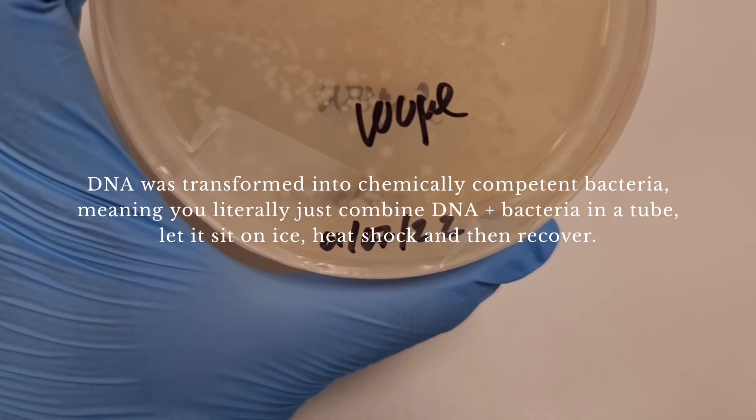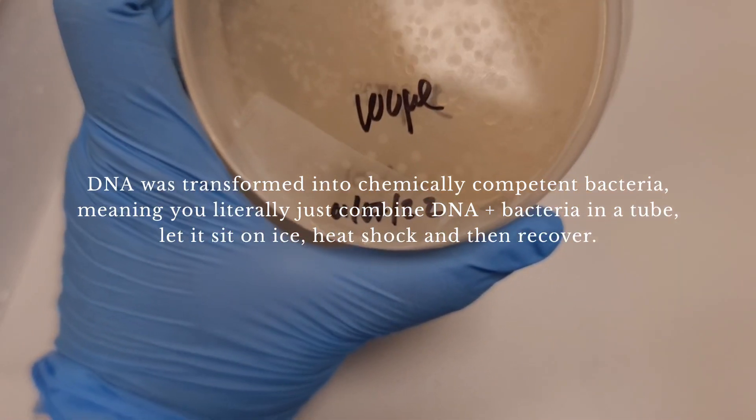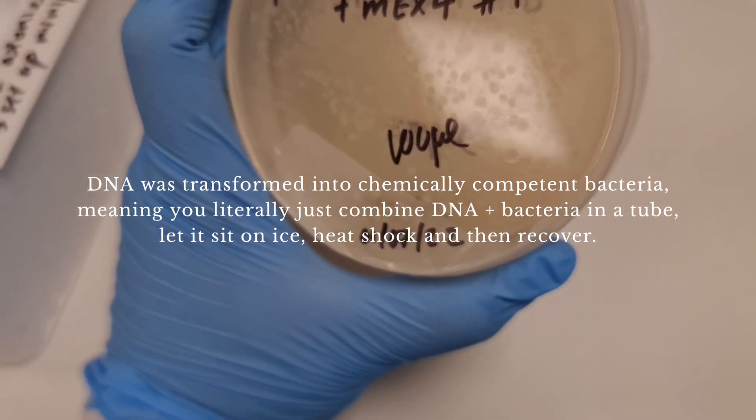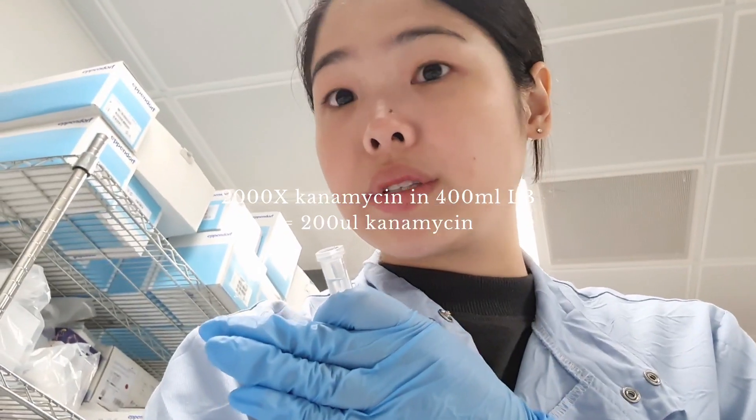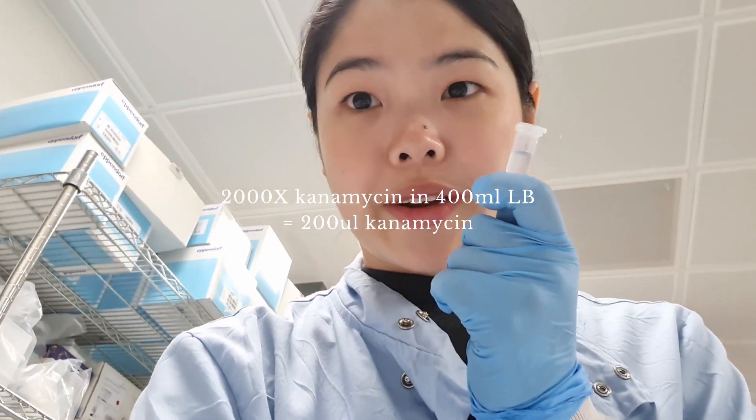I'll just be picking one and growing that in the maxi prep. Normally we inoculate it but because it's the weekend I just didn't really have time. Before I forget, I need to add some antibiotics. So here we have kanamycin and I'll be adding it at a 1-in-2000 dilution. So if we have 400ml of culture there, I'll be adding 200µl.